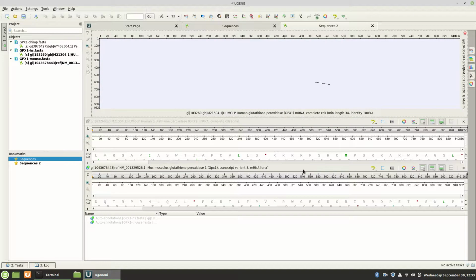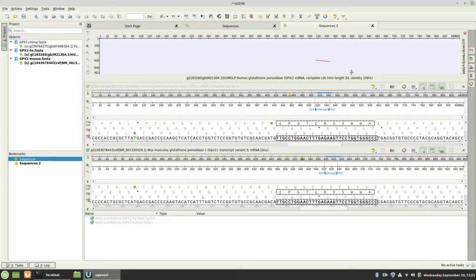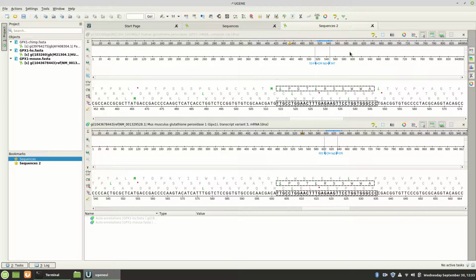Well, actually we did. I was expecting to get 0 here, so this means this piece right here is extraordinarily conserved. Everybody can copy this. This is probably conserved across every species, but as you can see, you have a piece of the mRNA that is conserved regardless of the distance here, it looks like, because that's extraordinarily conserved.